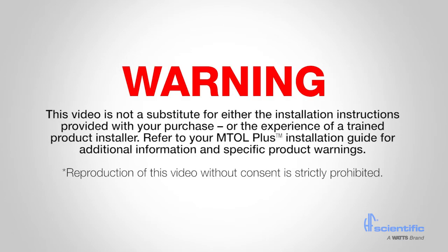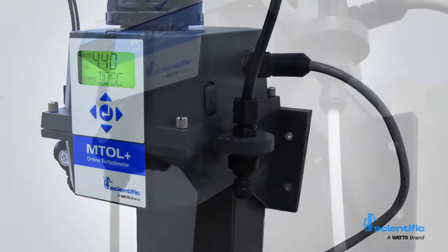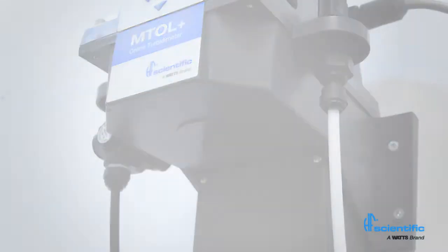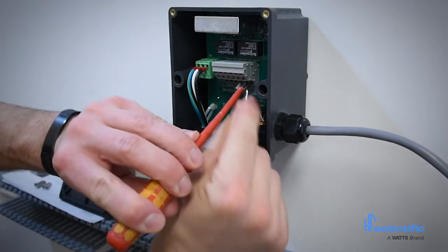This video does not replace the installation instructions. The instrument is mounted using 4 bolts for the sensor and 2 for the junction box. Plumbing connections are made using common 1/4 inch outside diameter tubing. All electrical connections are made inside the junction box. Refer to the manual for wiring details.